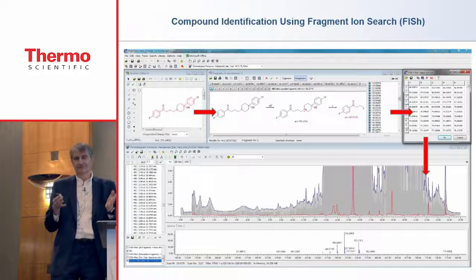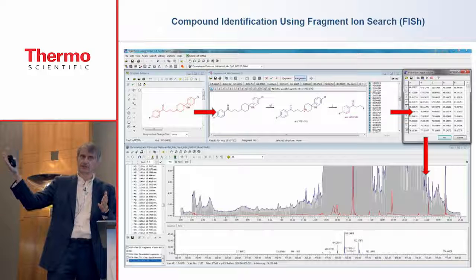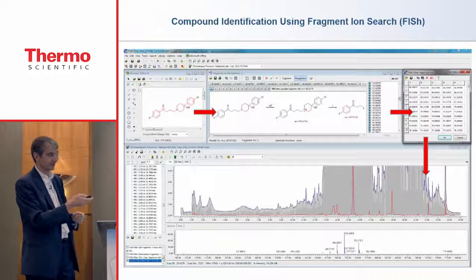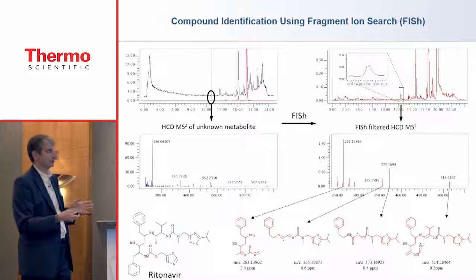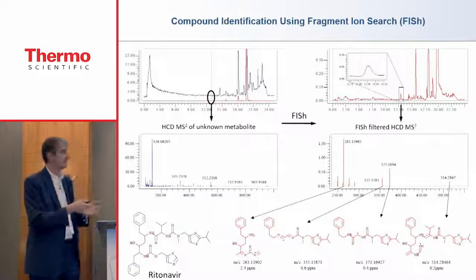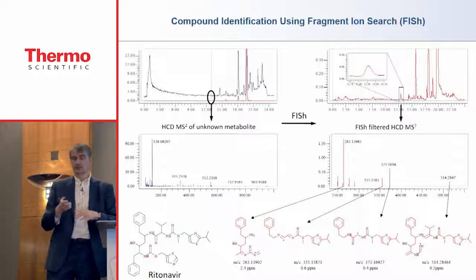So it can be very well used in impurity search, because you can take the precursor compounds or all the chemicals that were used to produce these compounds and search them in a chromatogram. The advantage of this method is not only that it shows you the peaks that are related with your investigated compounds, it gives you also some partial substructural information. And I have to admit, you have to put it manually together and make sense of all these results. But at least you can see what kind of substructure belongs to which chromatographic peaks.